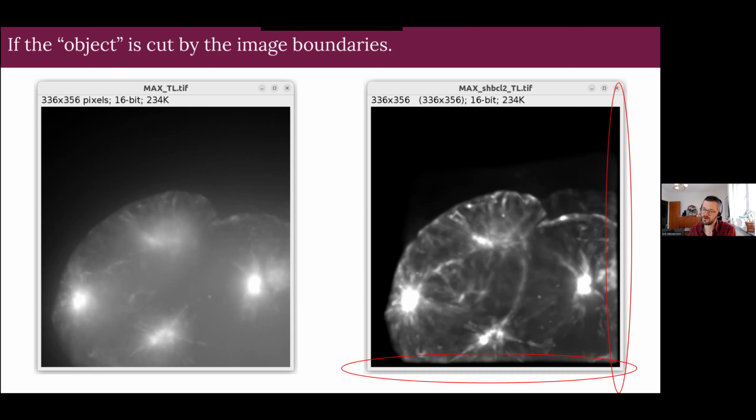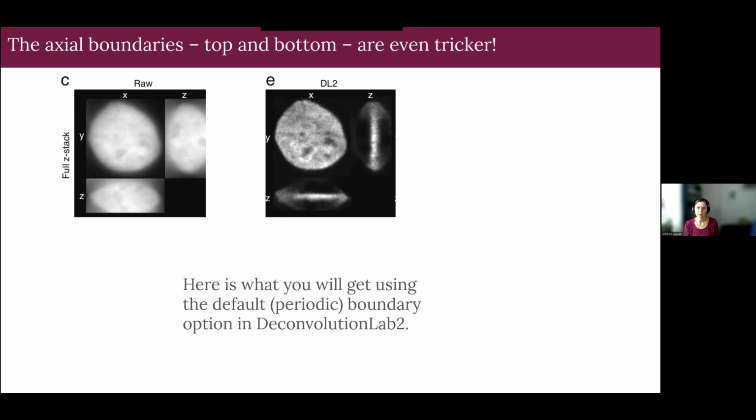So left and right is the same. You can imagine it's rolled up. Top and bottom are connected. Left and right are connected. Whatever is on the right will spill over to the left and so on. Some algorithms are implemented that way.